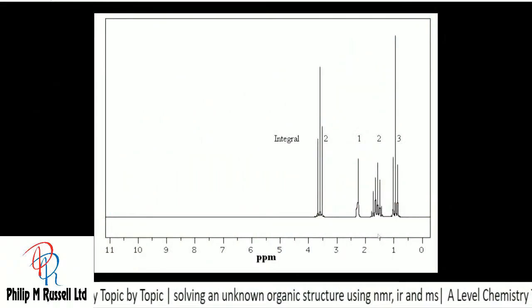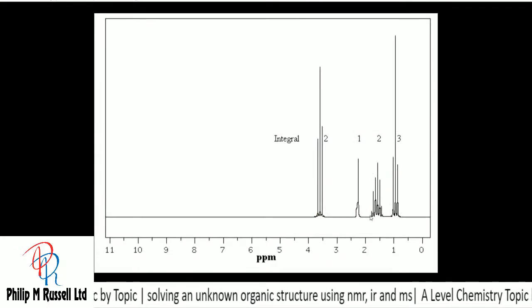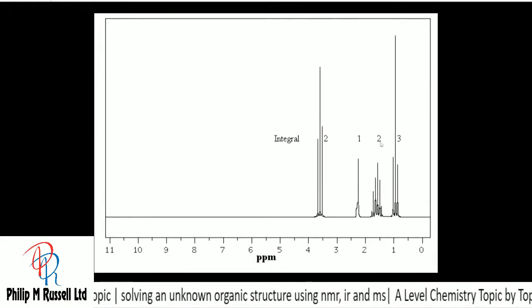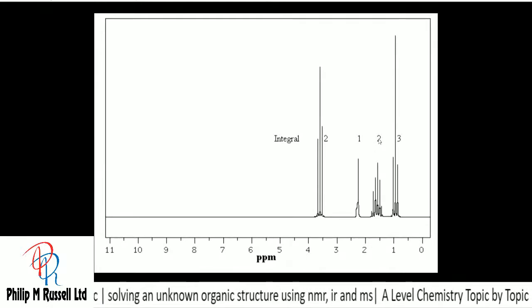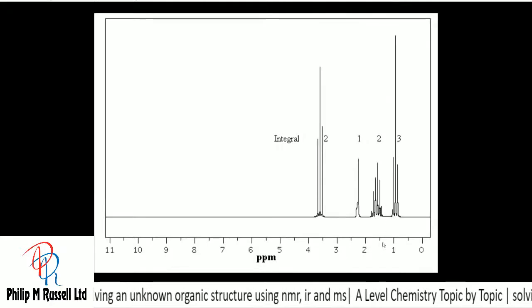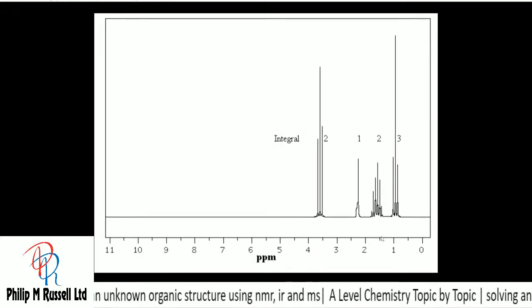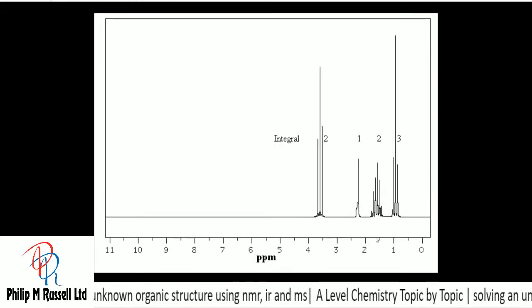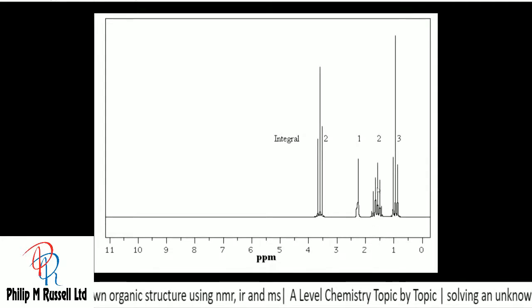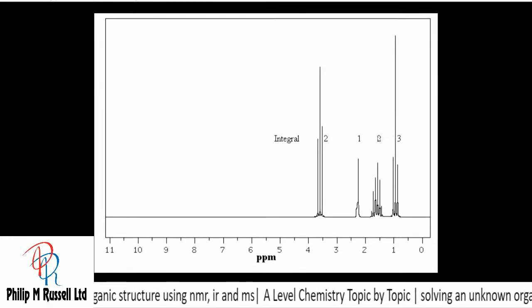And then if we look, now that's a multiplet, I would call that one. Well, you've got 1, 2, 3, 4, 5, 6. Won't panic. But the integral value of 2, is that 1.6 or 1.5? It is 1.6. Your gut feeling was right, it was just a bit more than 1.5. It's not 1.7 because 7's in the middle there, but it's more that way. Anyway, so it's about 1.5. Integral value of 2 tells us it's 2 protons in that environment.